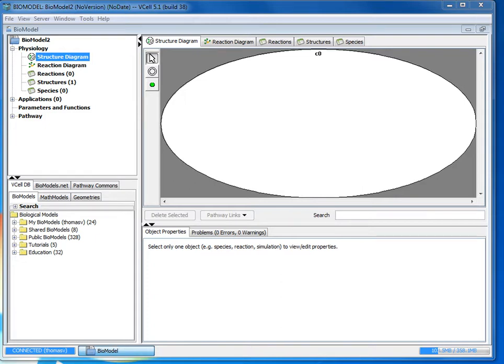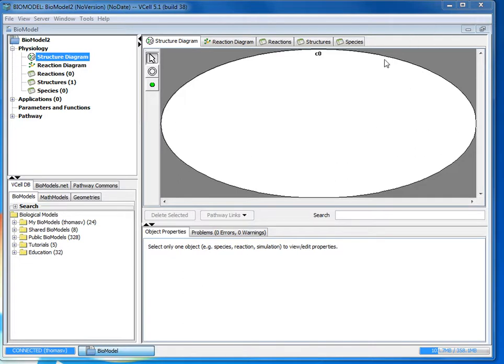Hi, this is Thomas Vecca and this will be a tutorial for Virtual Cell version 5.1. Virtual Cell is an environment for modeling cell biological processes developed at the National Resource for Cell Analysis and Modeling at the University of Connecticut Health Center. It is funded by the NIH and this will be a tutorial for a fluorescent redistribution after photobleaching or FRAP process.